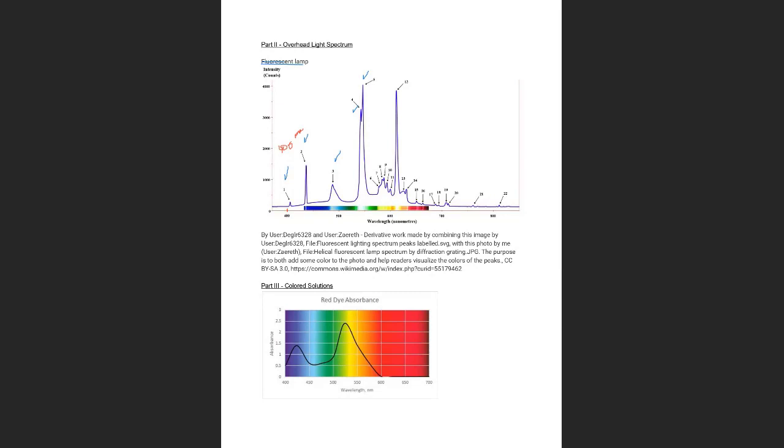Let's look at, let's say, peak number 5. When you use a ruler and you mark this wavelength, well, I wrote 552 nanometers. So the first part in part 2 is to identify the first 5 peaks and identify the wavelengths of those peaks in this continuous spectrum.